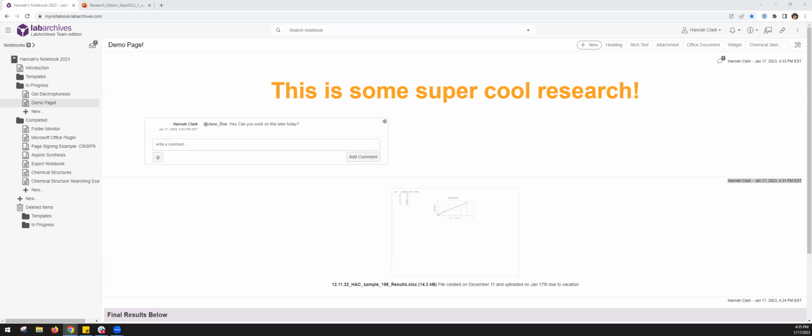I've heard really great feedback on a thing called Rocketbook. They're really cheap as well, which is nice. There's also smart pen technologies, if that's of interest to you. So there's higher tech options, but absolutely the easiest is just take your handwritten notes, take a picture of them. If they get into LabArchives, then you have a record of the work that was done there.